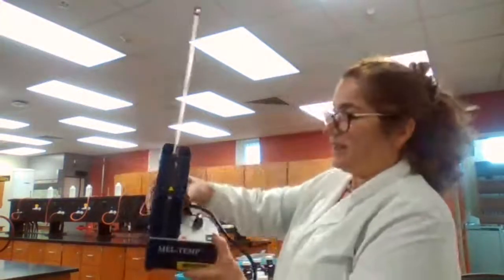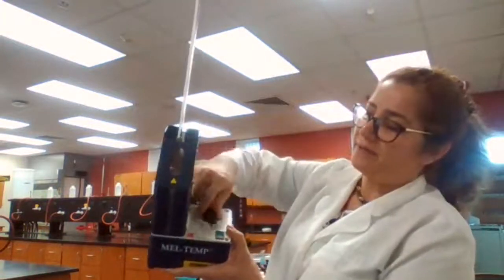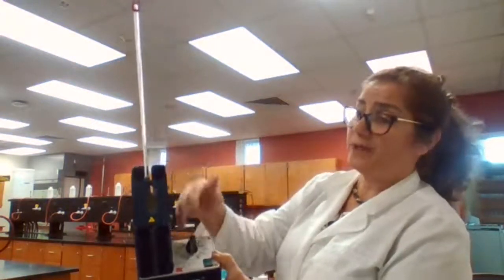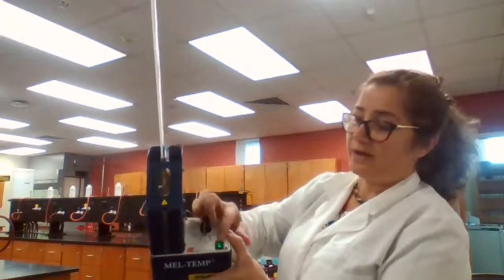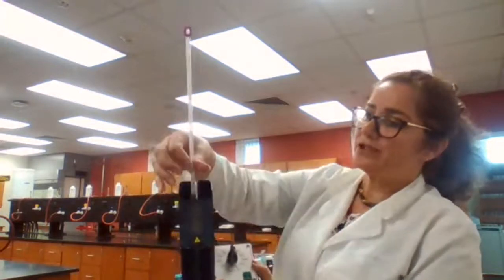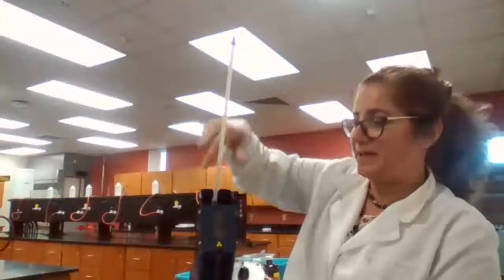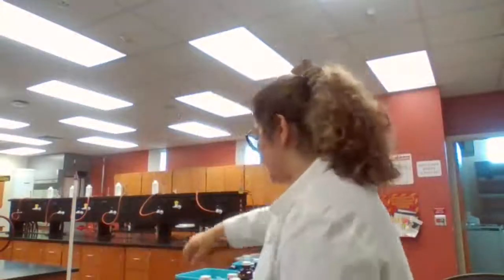On the surface of this plate, you see a power regulator. It goes from 0 to 10, and we can regulate how fast we want to heat the Mel-Temp apparatus. There is the on-off switch, again on the plate, that you can see. There is a thermometer holder where it holds the thermometer right here, and there is a very small opening here that we will soon place the sample in.